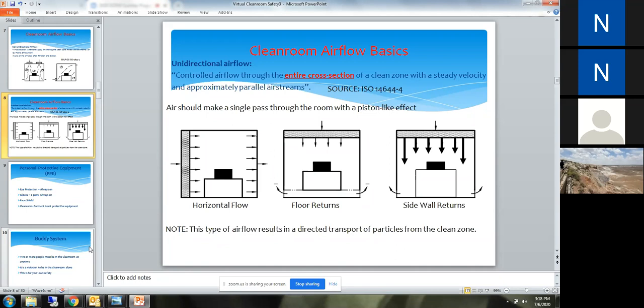It's the composition of the pencil: one is wood, and then you have the carbon or whatever it is that's in the middle of the pencil. All those are things that shed particles, as much as a cardboard box coming from wood as the parent source. So wood, cardboard boxes, plastic, anything that's not designed to go in the clean room is not good for the clean room.